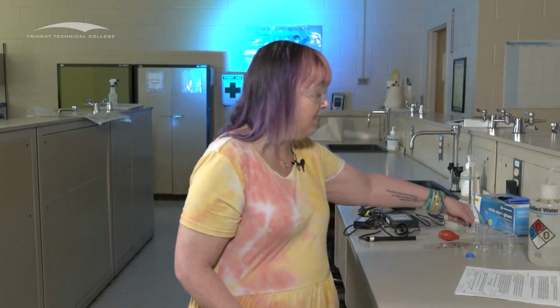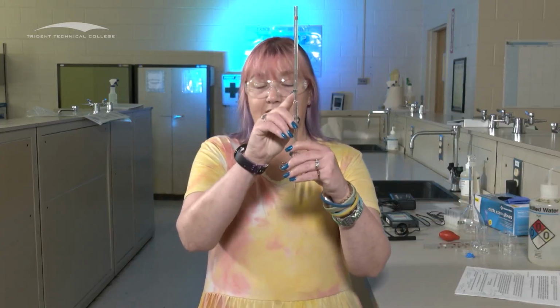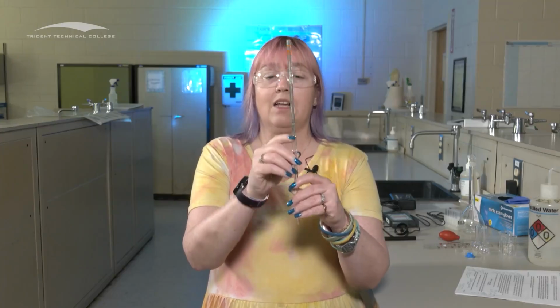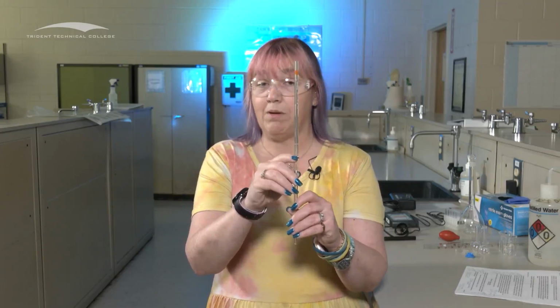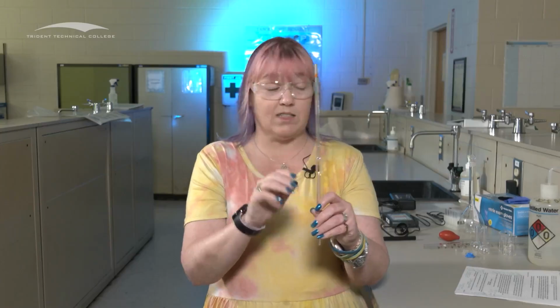When we talk about something like a volumetric pipette, which is one of these guys, there's a finite measurement that's here, and we can't estimate beyond that. We know exactly what that is, and so if this is a 1 milliliter pipette, we know that this is 1.00 milliliters. That's the precision that we know for that particular instrument.